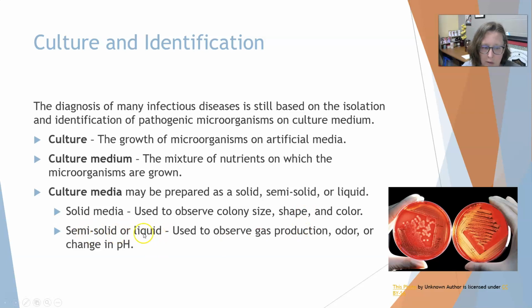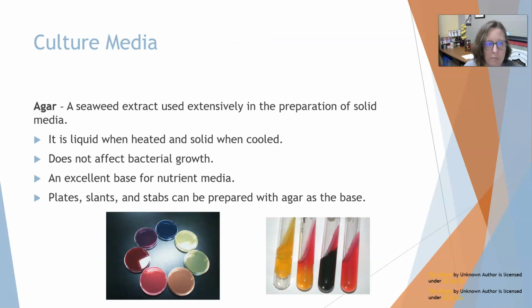The semi-solid or liquid media are used to observe things like gas production, odor, or changes in pH if there's a color indicator in the liquid.